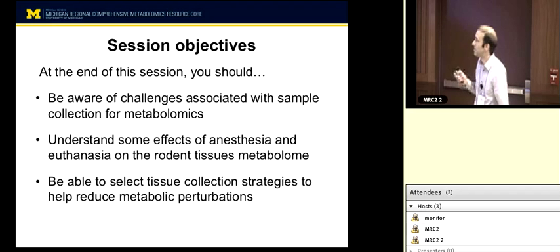And just to state ethics, anytime you're doing animal work, as you well know, you need to follow appropriate ethical procedures and have your procedure approved by the Institutional Animal Care and Use Committee. All of this was approved by that. So here's a workflow. We took C57 black 6 mice, probably the most studied animal model that's out there as far as rodents are concerned.